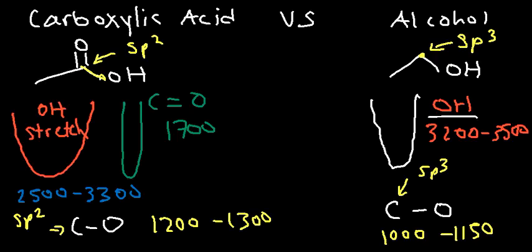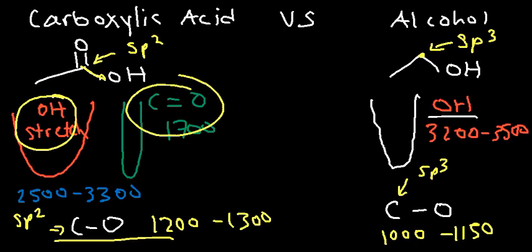So when you see that, that's another secondary indication that you may have a carboxylic acid. But the two most important signals to look for are these two. And then you could use this third one just for confirmation.